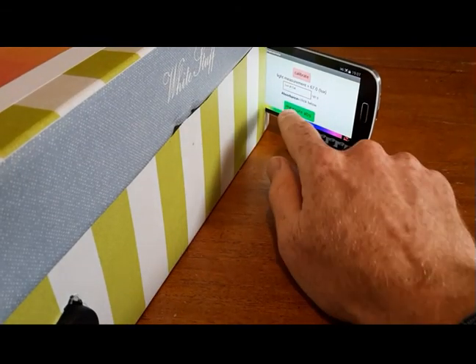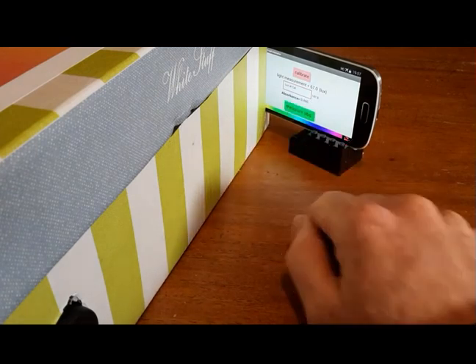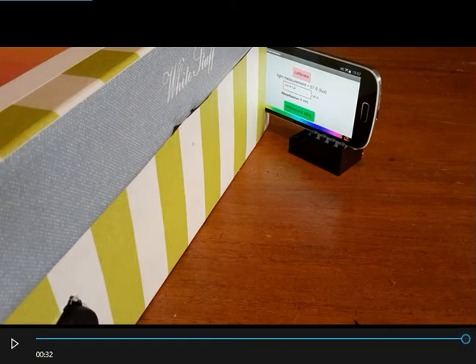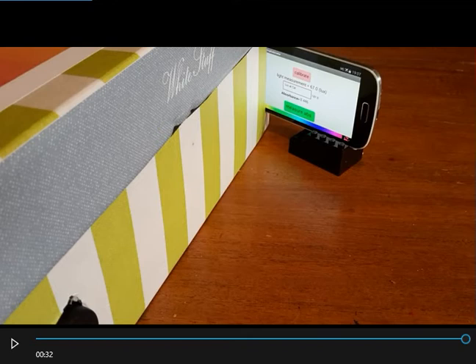It might be a bit hard to see, but you can probably just make out that the absorbance value is 0.446, I think, for that sample. If you've got other samples, in the same way you'd use a lab spectrophotometer, put another sample in and press measure absorbance.